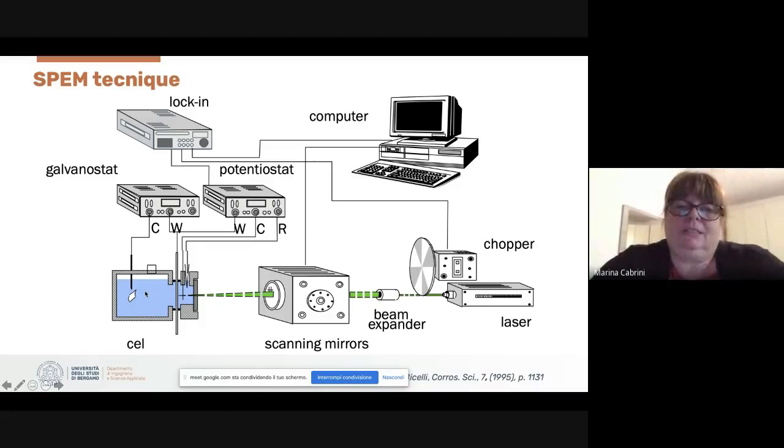this is a traditional Devanathan-Stachurski permeation cell, in which one side of the specimen is cathodically charged by hydrogen, and the other side is in an anodic compartment in which there is an alkaline solution, and in which, without hydrogen, the anodic passivation current is measured, and in the presence of a laser light, the photo response of this passive film.